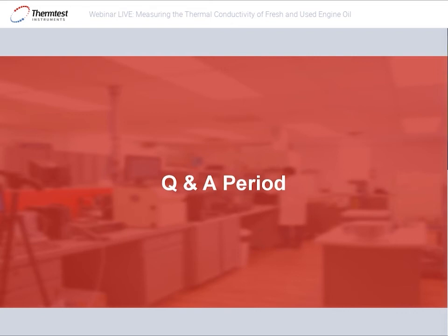We have a question. It says, what's the PCM sample? It is phase change materials, materials that can change with the temperature, can go from the liquid to solid phase. I had a previous webinar on measurements of phase change materials. If you would like, we can share it with you or you can find it on our website. And you can see the thermoconductivity results and the anomalous thermoconductivity change of these materials.